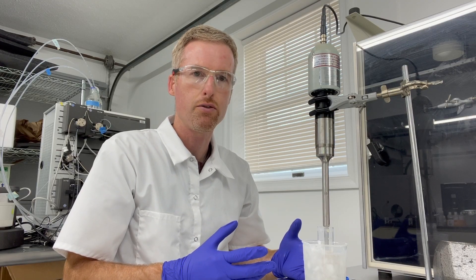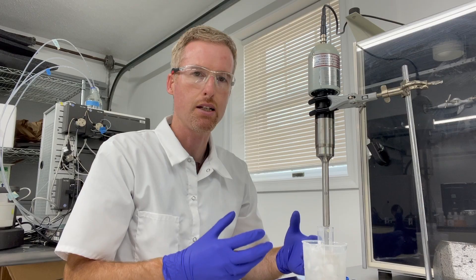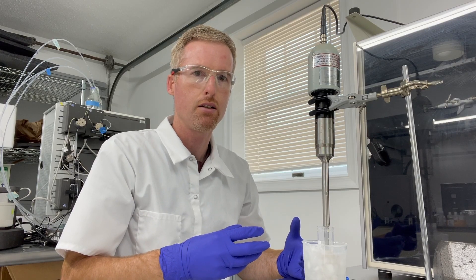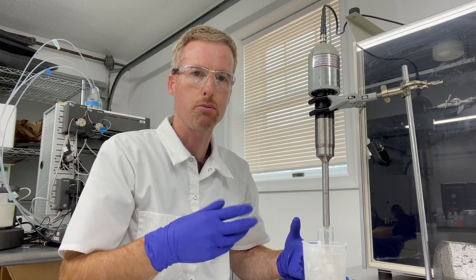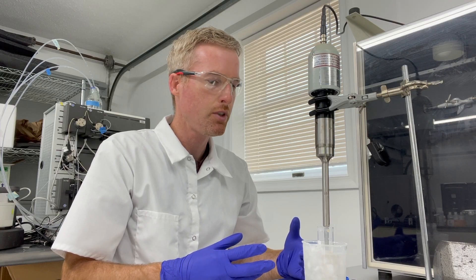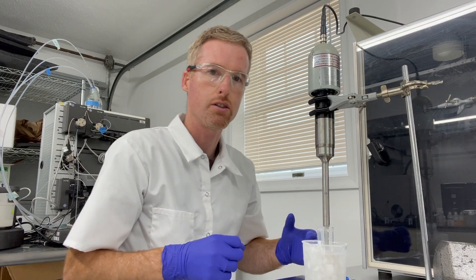If you're not certain if your sonicator is breaking the cells, the thing to do is to weigh the cell debris that you pellet in the next step. Make sure that it's less than the weight of cells that you put in at first — that would indicate that the cell debris weighs less because the cells got lysed and that cytoplasmic material went off into solution like you want it. So the cell debris needs to weigh less than the cells you put in.